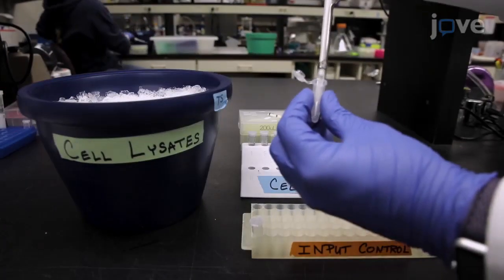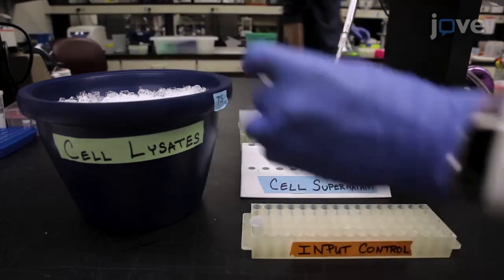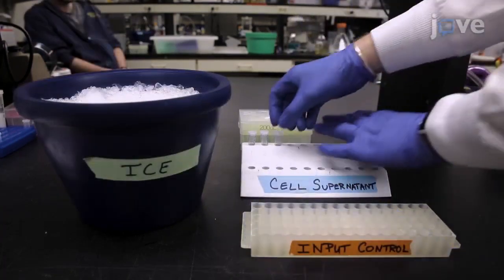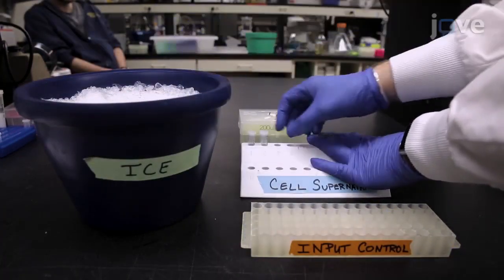Remove 40 microliters of the remaining supernatant to be used as an input control and transfer it to a new tube. Place all of the samples on ice.